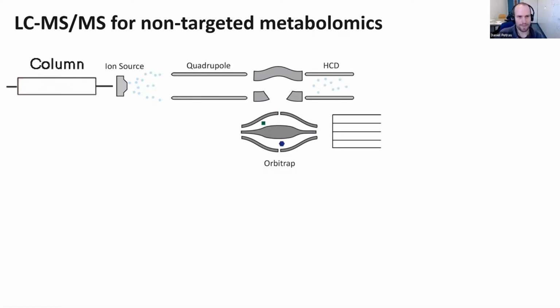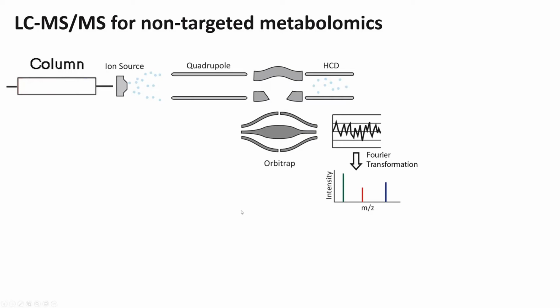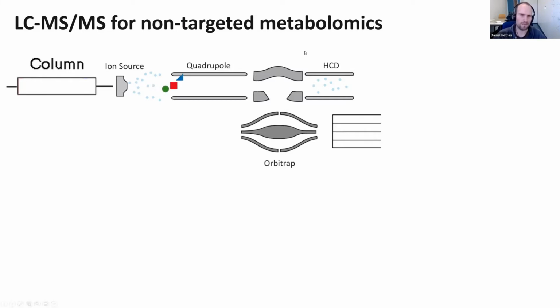And I think for me, when I first learned about this, this was a key moment, and I thought, oh yeah, cool, that makes a lot of sense, because the mass spec is basically operated in a somewhat smart way, which we call data dependent acquisition. So DDA, this is a really important term you should write down or remember if you want to do non-targeted LC-MS based metabolomics in the future.